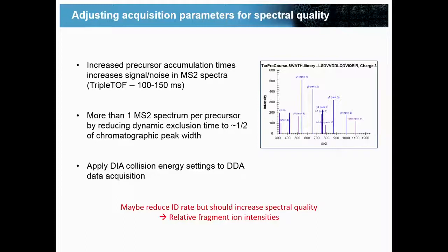So in DDA and DIA collision energy, do you use high collision energy in DIA with respect to DDA, or is it lower than DDA? Well, how do you decide that?